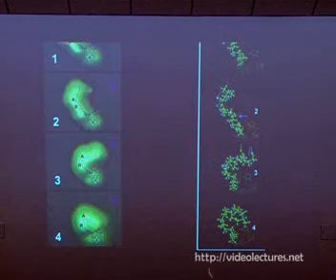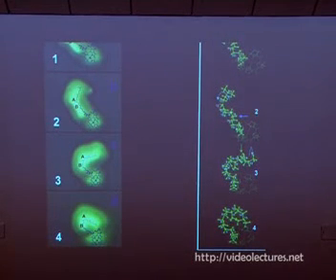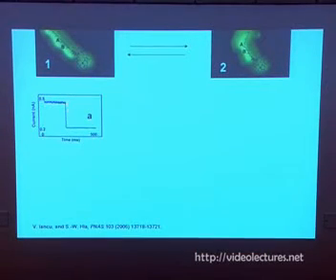So this is the library. What we are doing here is actually rotating a single carbon-carbon sigma bond at two locations. One is the C12-C13 bond, another is the C7-C8 bond here. With each of the electrons, as soon as it switches, you see the changes.